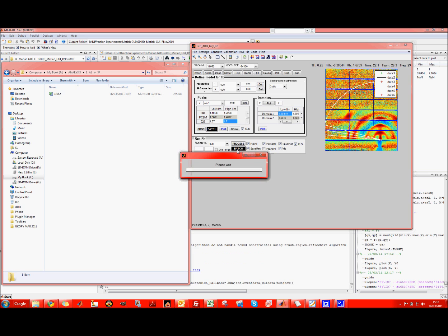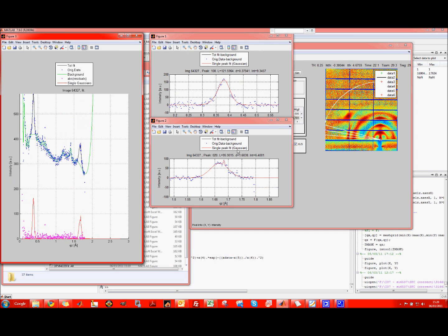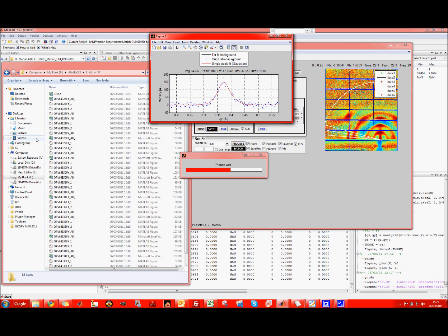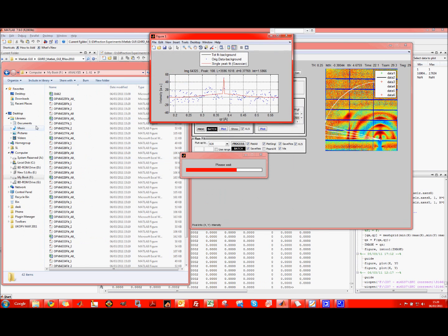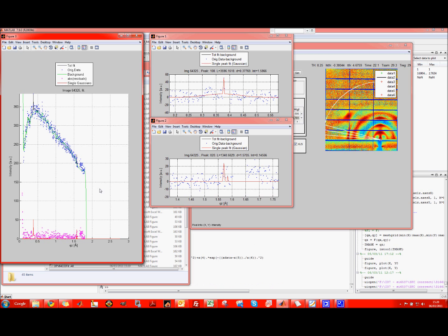So we start, and then clearly, if you want, you can define boundaries for the domain of the background and see if you get better results, or you can also try to use a single Gaussian and see what happens.